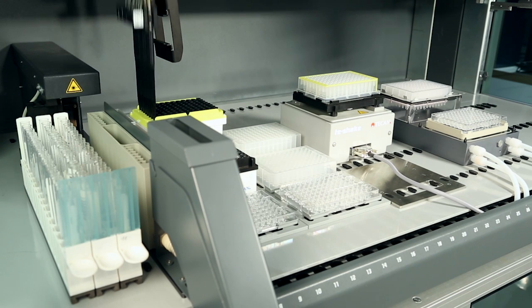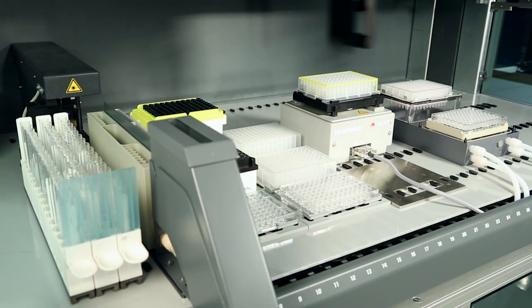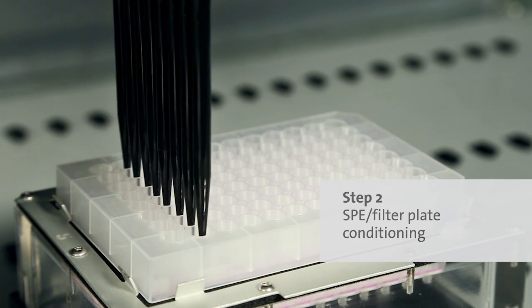The 8-channel liquid handling arm can transfer a wide range of liquids and volumes precisely and reliably. The result? Remarkable liquid handling for consistent results.